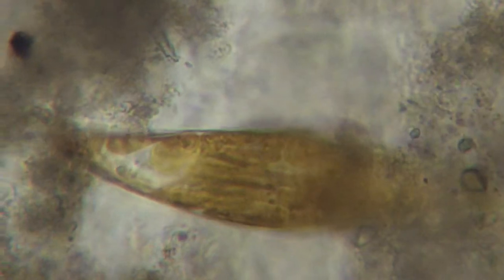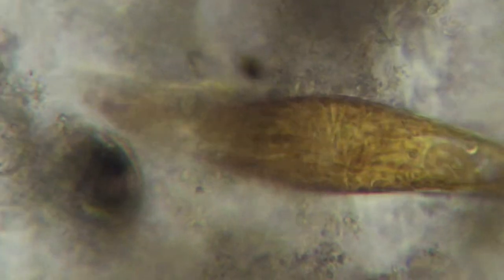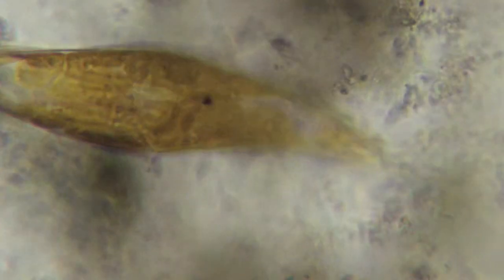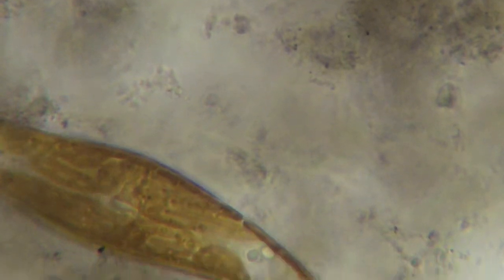But anyway, so these oil droplets are food storage, probably flotation, although they can move, so they don't really need it so much. And maybe have some other purposes that I'm not aware of, but nice little spheres in there. You see those little spheres? Small little blobs. You can really see it in these big ones. Harder to see in some of the smaller diatoms. And it's trailing some muck here, connected to its little end piece. It's got passengers there.